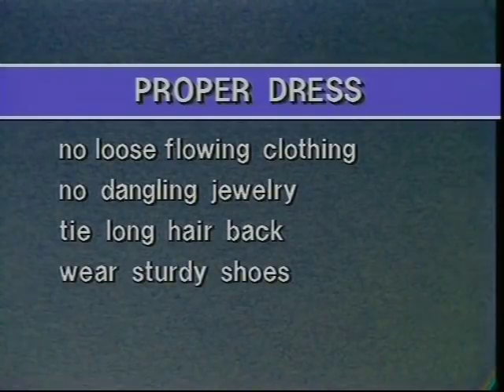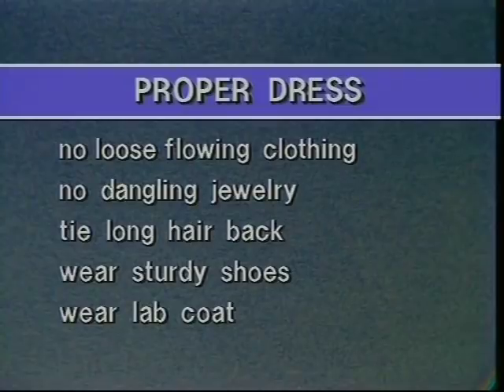Wear sturdy shoes. Never come to a lab in bare feet or in sandals. There's a great possibility of broken glass cutting your feet and chemical spills injuring bare or sandaled feet. In the lab, a lab coat or apron will help protect both you and your clothes from chemical splashes and spills. Perhaps most importantly of all, as soon as you enter any chemistry lab, remember, you must put on your safety glasses or goggles unless instructed otherwise.